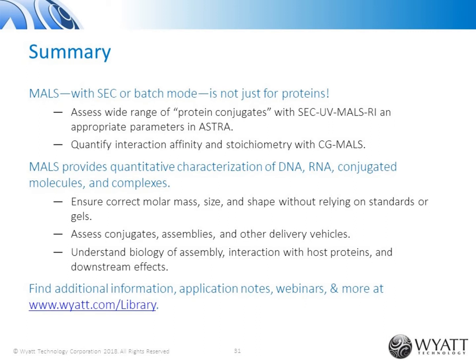typically for aqueous buffers that don't have a lot of extra excipients or other things in them, you can use that 0.17 value for nucleic acids and the 0.185 value that we typically use for proteins with good accuracy.